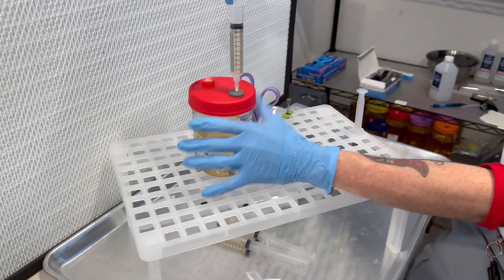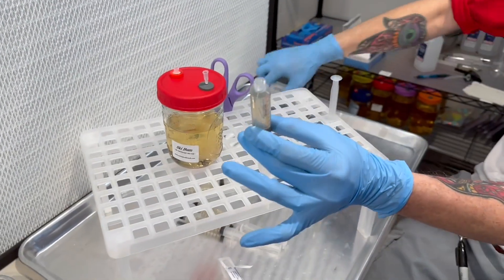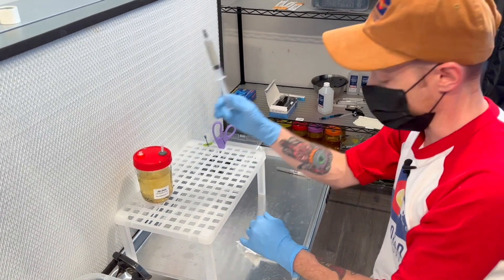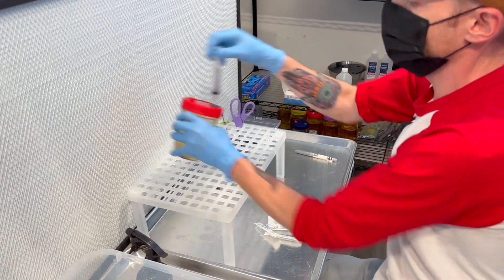Hold the needle, twist the syringe, and cap it up just like that. Then just keep on doing that until it's all done.